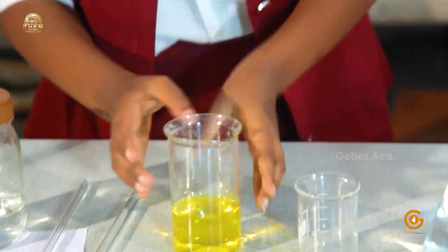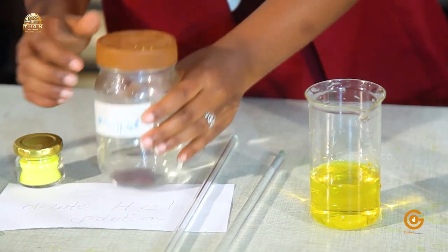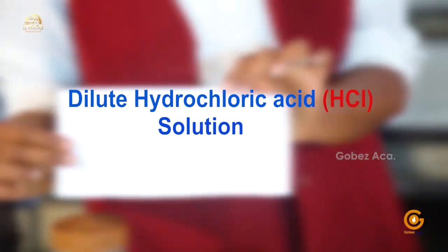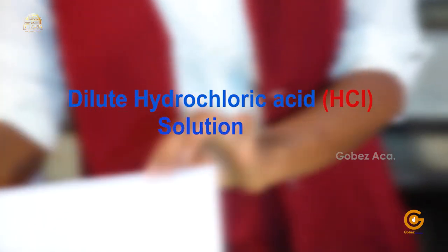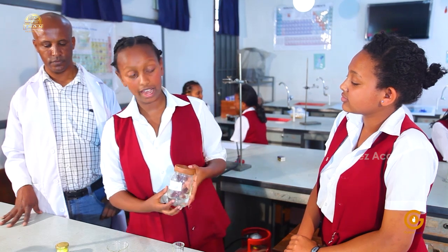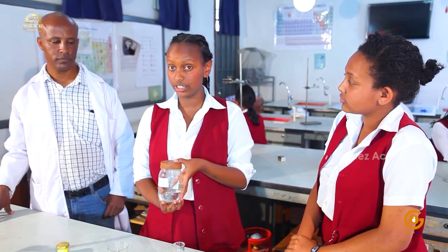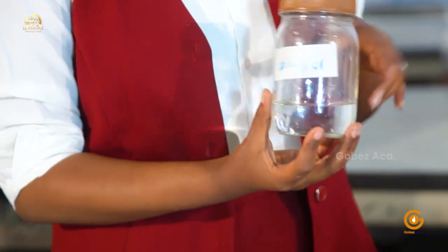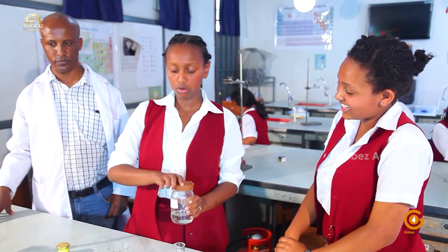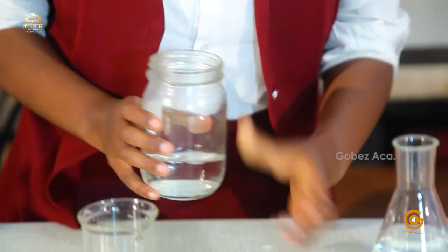Okay, so here I have my potassium chromate solution. Yes. Then I will need a hydrochloric acid solution. So I have here, as you can see, a dilute hydrochloric acid solution. Now, when we are dealing with acids, be careful that they are dilute. Fortunately, we already have a dilute hydrochloric acid in this lab, but in your laboratory, if you only have concentrated solutions, be sure that when you dilute it, add the acid to the water, not the water to the acid. So, yes. Because I have a dilute, no need to dilute this anymore. I'm just going to add it into my beaker.